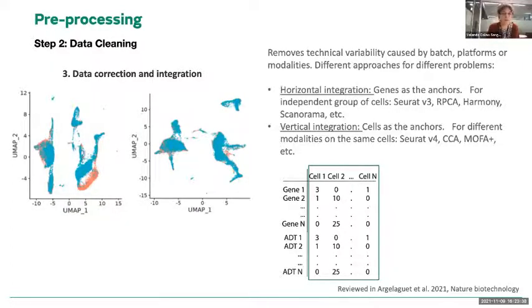So for example, you have ATAC-seq and whole transcriptome RNA. And I would say this is the easiest way of integrating the data because you know exactly which cell is coming from, so you can really correlate very easily the gene with the antibody or with the chromatin accessibility of all of that.